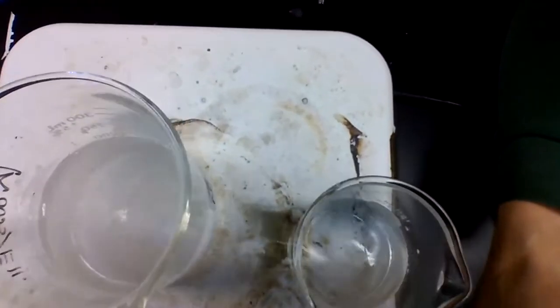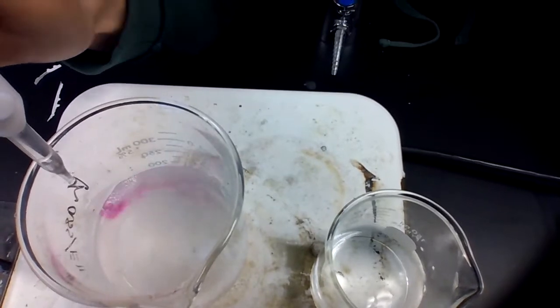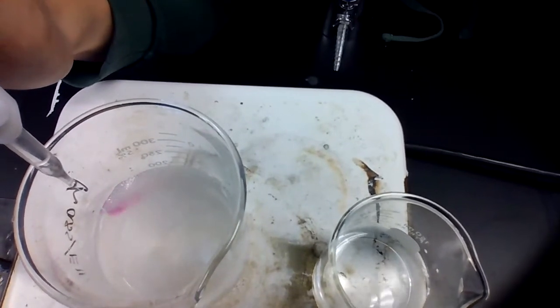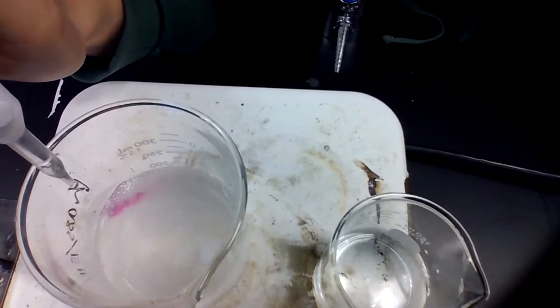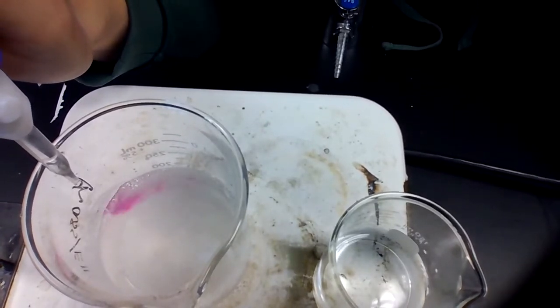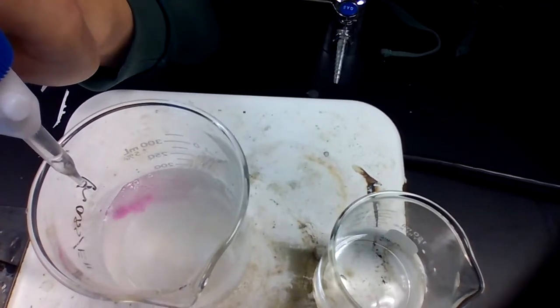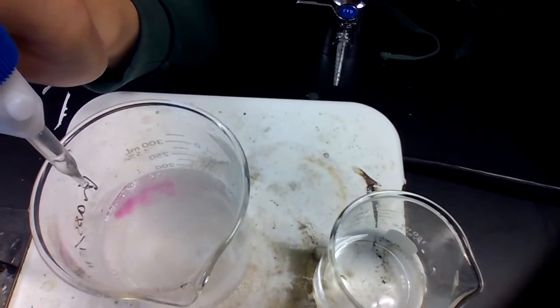Okay. Let's see if I can hold it there and run the burette at the same time. See that extra pink and how it flows in and then goes away? You are watching a neutralization reaction in action.